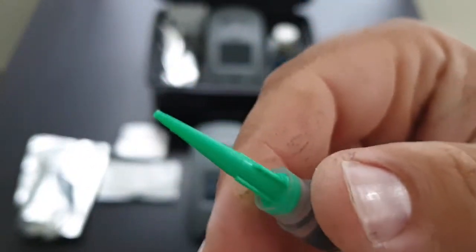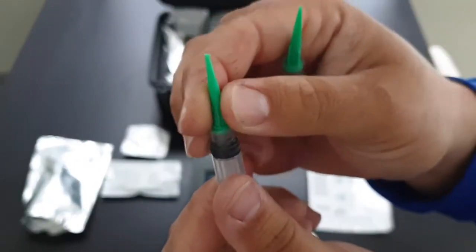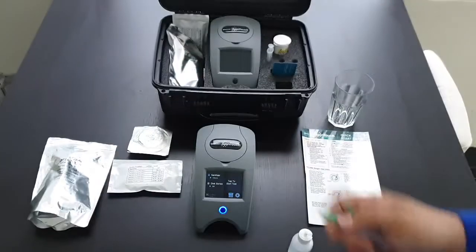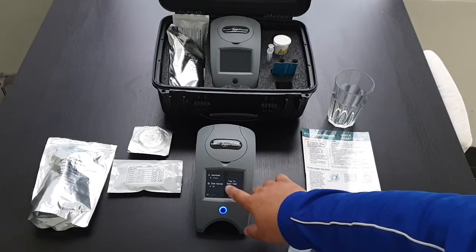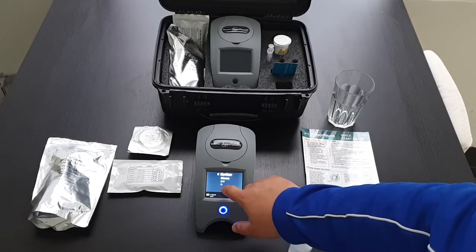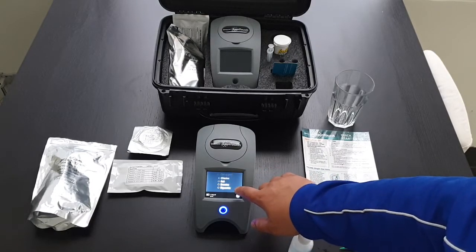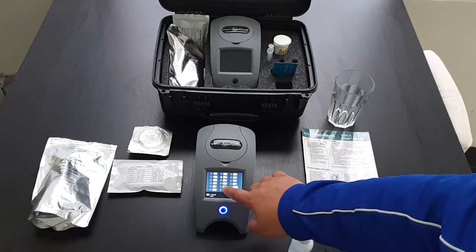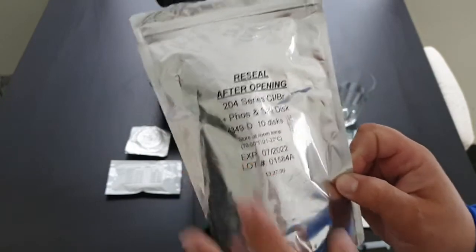This is a nice new one — these are changeable. To start the test, tap to start. You want to make sure that you've selected your sanitiser. In this case we're testing for chlorine. Select the correct disc — we've got a 204 series.